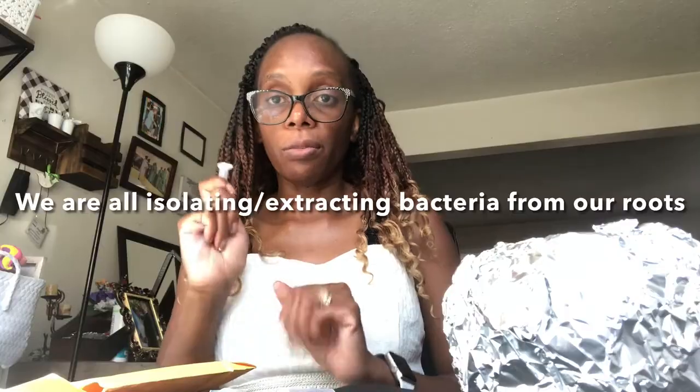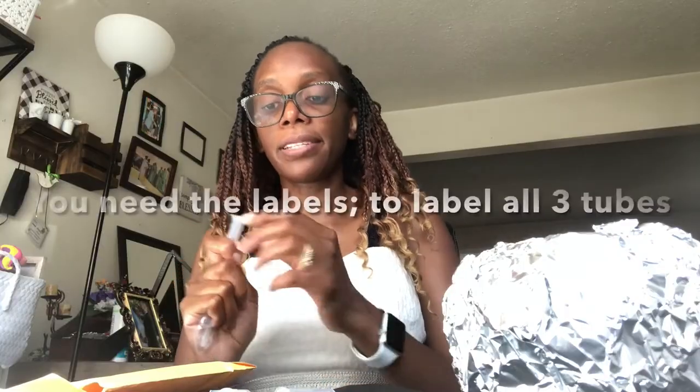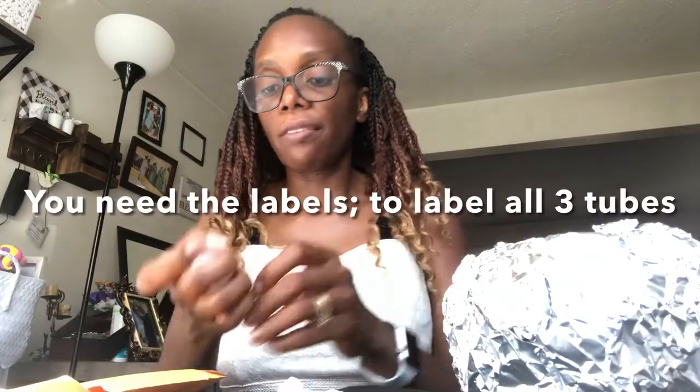So it's possible that if you don't have any root nodules, maybe it's that initial stage, where the communication has happened, some bacteria are in there, but they haven't formed nodules. Or there could be other kinds of bacteria in your roots that don't induce root nodules. So we are all isolating bacteria from our roots. All right. Okay, so have those three.